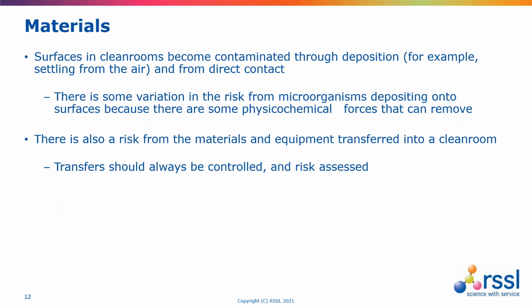So in considering the risk of surface contamination, it's sometimes likely that the microorganism may not remain in contact for a long period of time, or it might do. So we have to weigh up that risk as well.